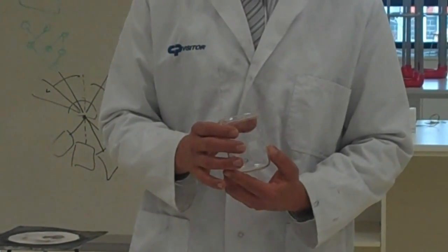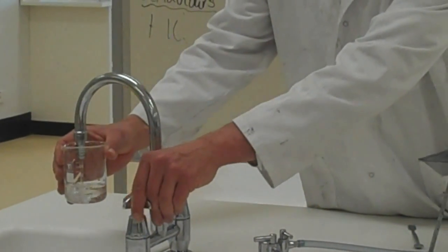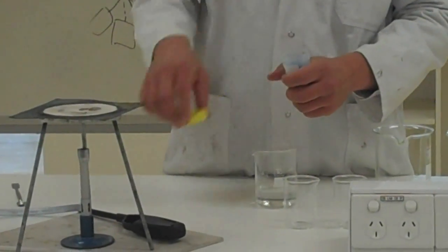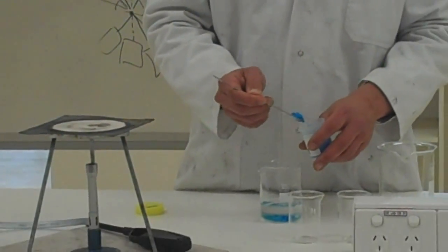Just approximate — the exact volume isn't that critical at this stage. So I'm just going to quarter fill this. Now I'm going to dissolve as much copper sulfate as I can into this water. What I'm trying to make is what's called a saturated solution.